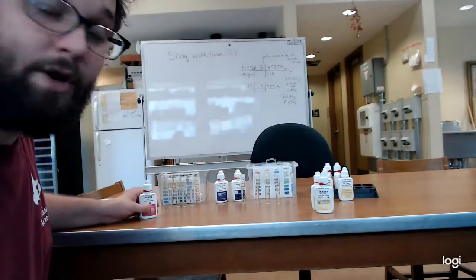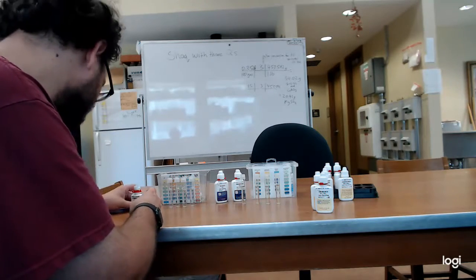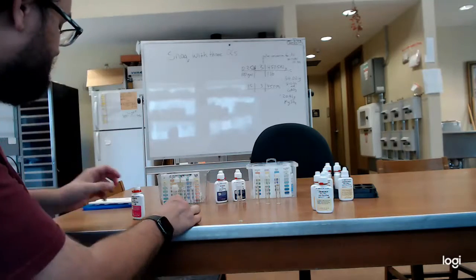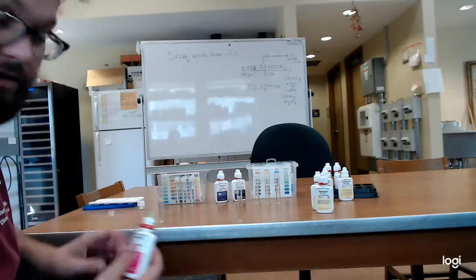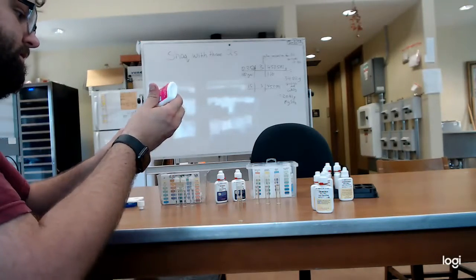But anyway, we're going to go through a couple titrations really quick. These are all pretty simple. I really like API. They make very easy test kits. And as I was mentioning in one of my first videos, I think it's very important that people learn to become mindful whenever they're taking data.